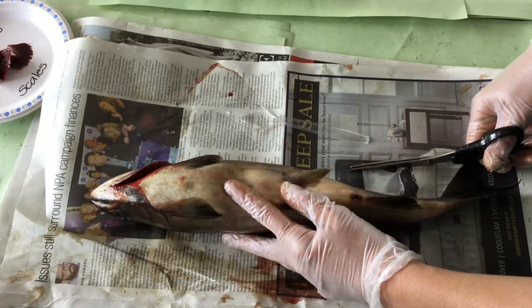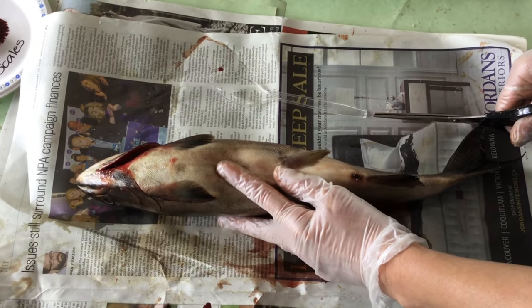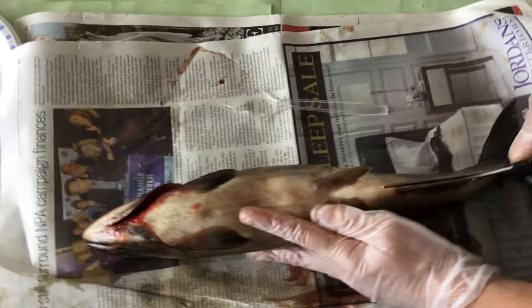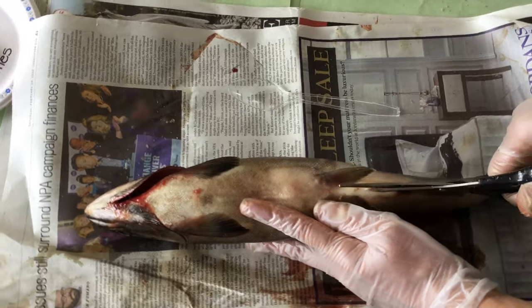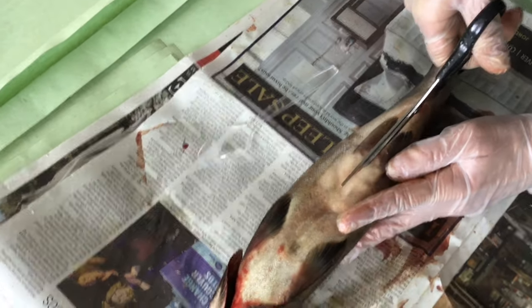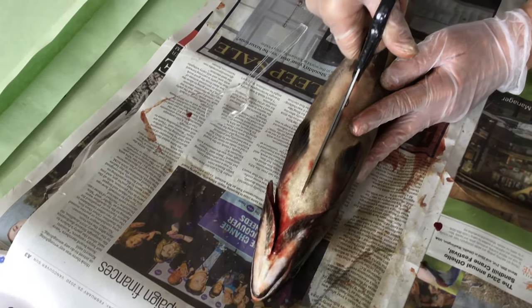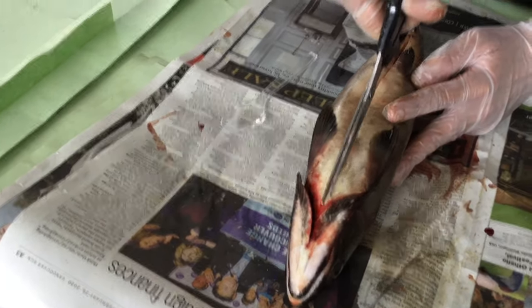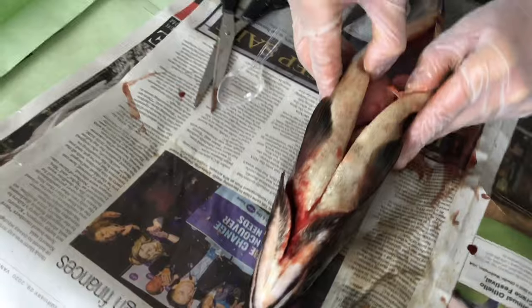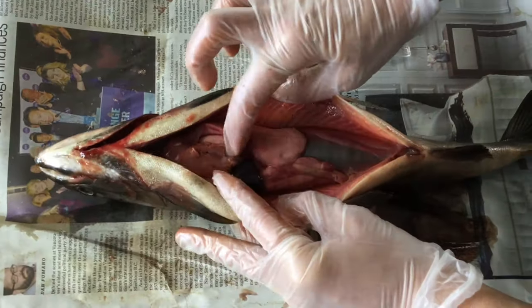Okay, we are now going inside the salmon to look at the internal anatomy. First, we need to cut the fish open, starting at the vent and ending at the throat. Miss Anima will do the honors. Oh, just like cutting fabric or something. And now she is going to open. And we will see. Magic moment.